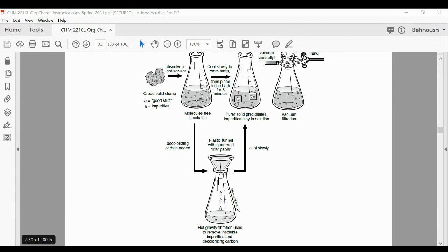Yes, yes. The calculation is based on aniline as the reactant and acetanilide as the product. So adding a stirring rod can increase the surface area and cause a seed to form. Yes, yes, it will. Okay.